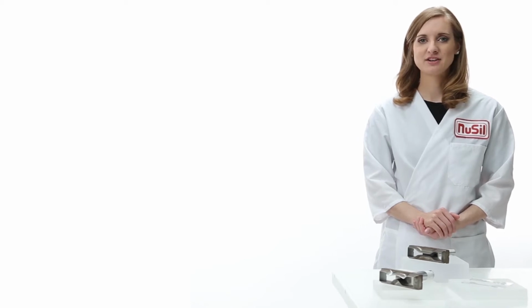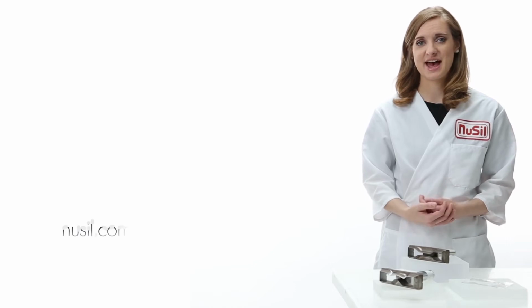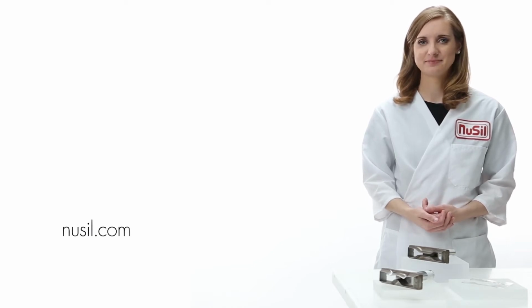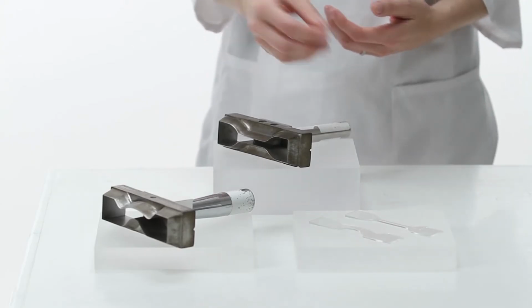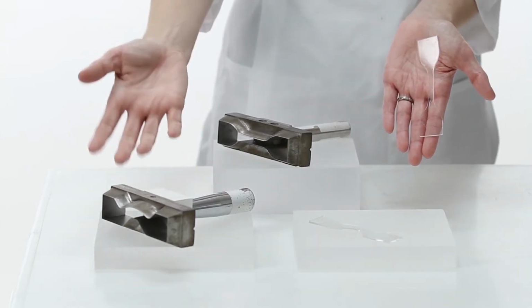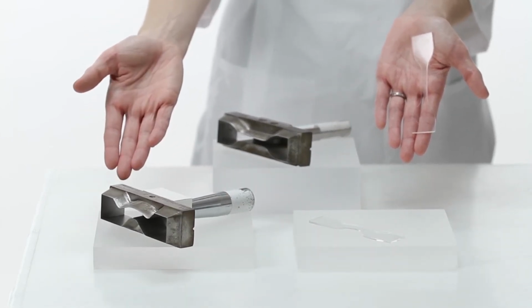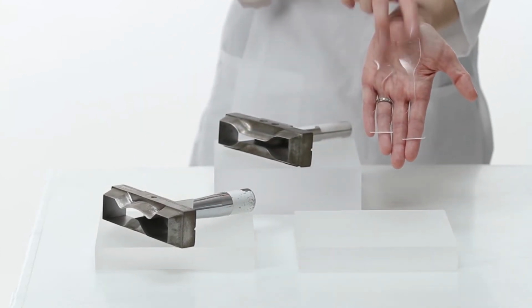Today we will be testing a cured NuSil silicone elastomer, which is done in our applications lab. The material was prepared into a slab for testing. For more information on how to prepare a slab, visit nusil.com. The slab was cut into a specific shape with specified dies. This die is used to cut tensile and elongation bars. This die, which has a built-in nick that introduces a defect into the sample, cuts tear bars.